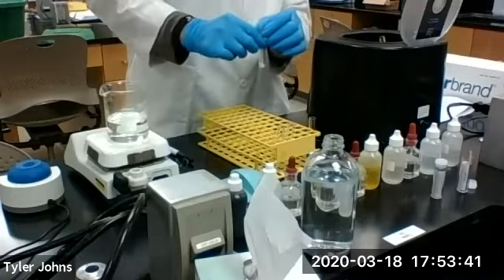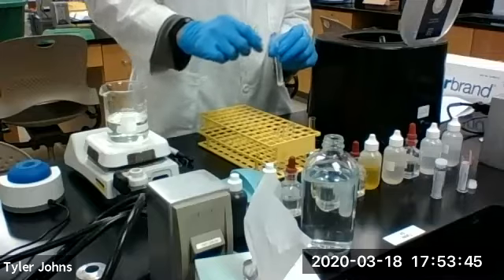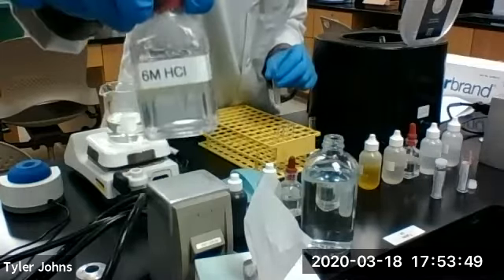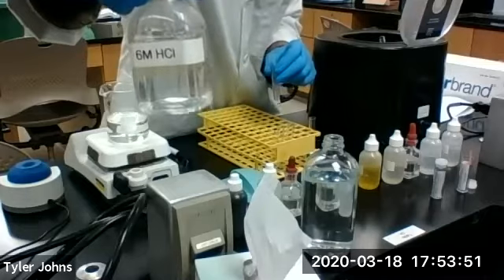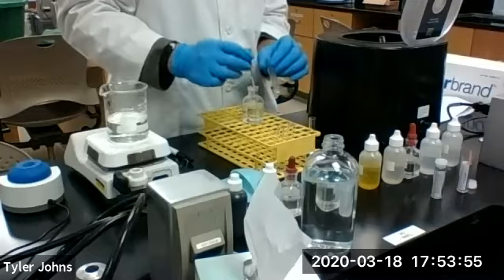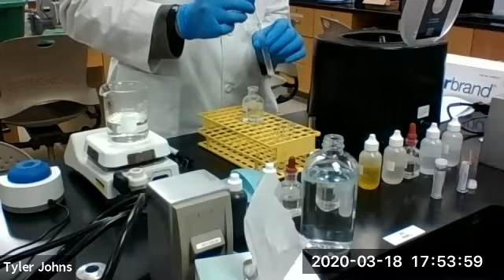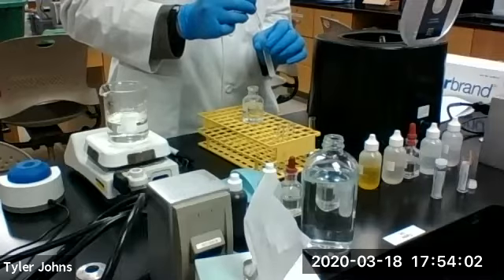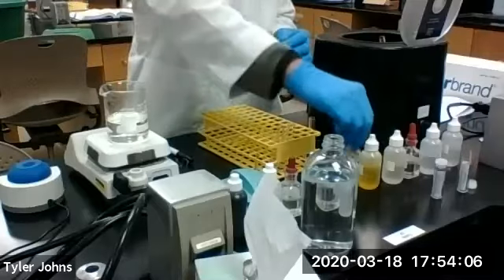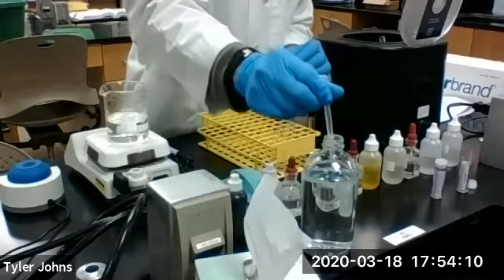To this precipitate, we are going to add a couple drops of 6 molar HCl. We have a 6 molar HCl here. We're going to fill up to 1 ml with water.